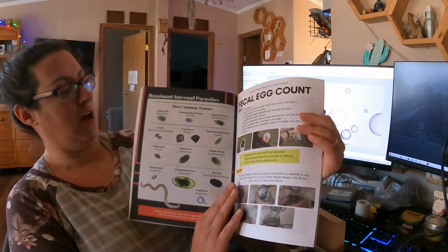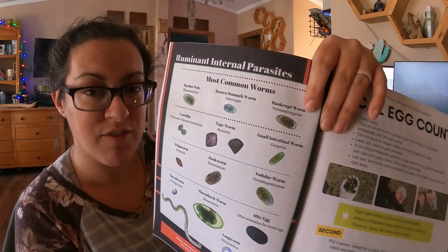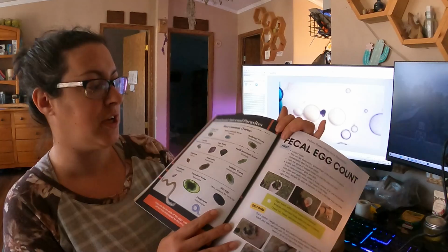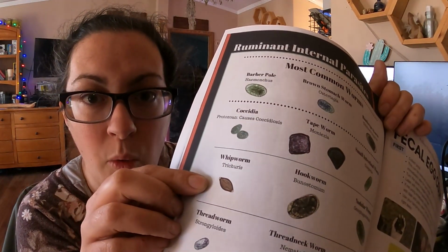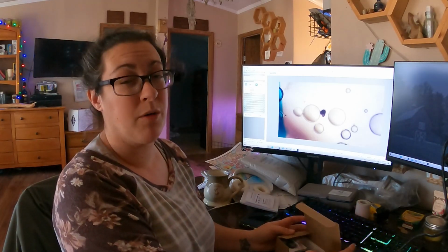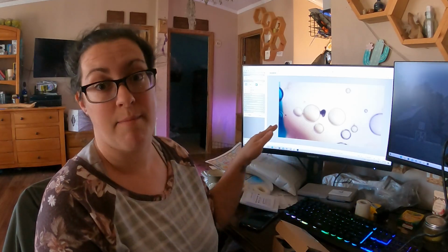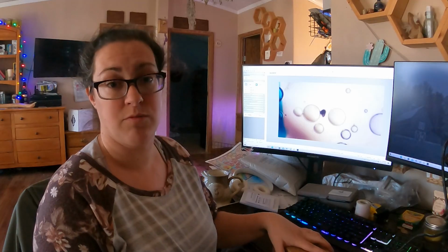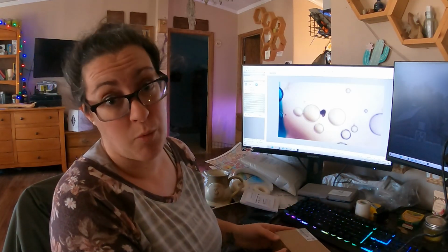And so I've been going through her binder and looking at my slide while cross-referencing this common parasite egg sheet. And this is where I've decided that this is what I'm seeing. I'm seeing a whipworm on Christine's fecals, but only 2 eggs, so she does not have a heavy worm load at all. But it will be kind of cool to compare what I'm seeing now versus what I might see in a month or 2 when spring actually hits and the real worm season actually hits. We're not quite there yet, but it is starting to get warmer outside.